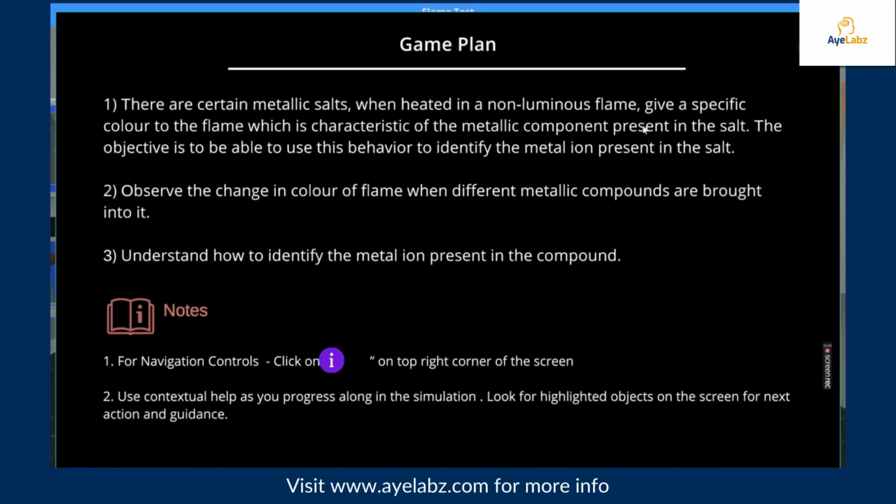Each simulation begins with a game plan. This outlines the overall procedures, observations, and learning of the simulation. If you are a new user, kindly go through this section thoroughly to maximize your experience.